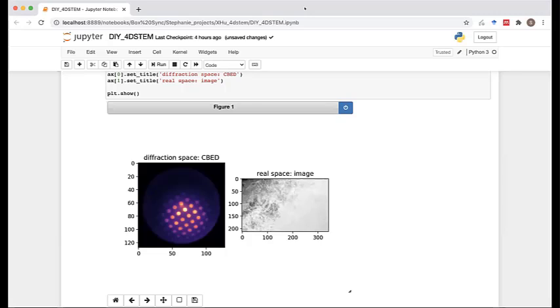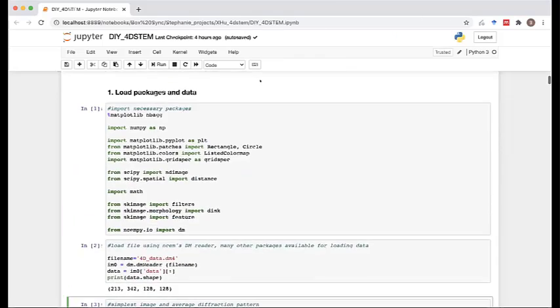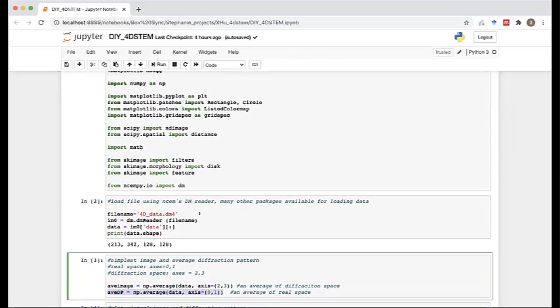Yeah, I have a question here. So you talk about loading the data, right? Most of the extensions, especially the recent Digital Micrograph data sets, you save the data in the DM4 extension, right? So that can be loaded not only in Python, but also in, say, MATLAB or using other packages like Stephanie mentioned. But one question that I have is this: what is the initial format? If you can go back a little bit on the 4 dimensions. So what do those numbers, 213, 342, 128, represent?